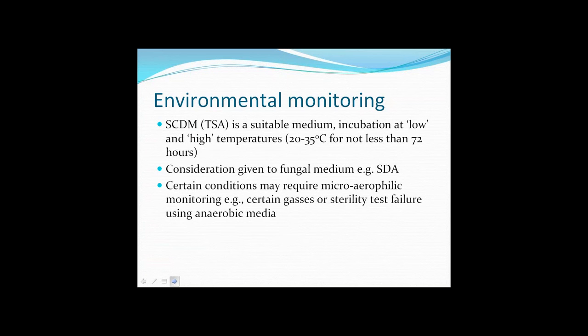The USP chapter also then considers culture media and the incubation regime. So with culture media, it discusses soybean casein digest medium, or what everyone commercially knows as TSA, tryptone soy agar. With incubation, it talks about the need to have a low and a high temperature, and it discusses a range of 20 to 35 degrees centigrade for not less than 72 hours.